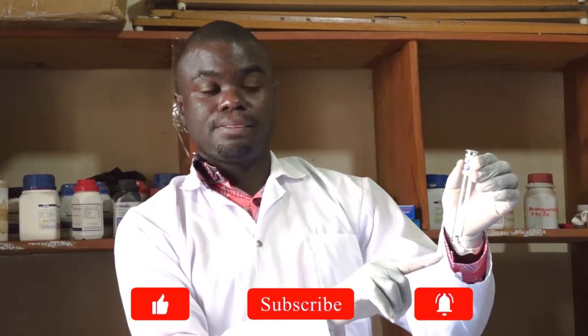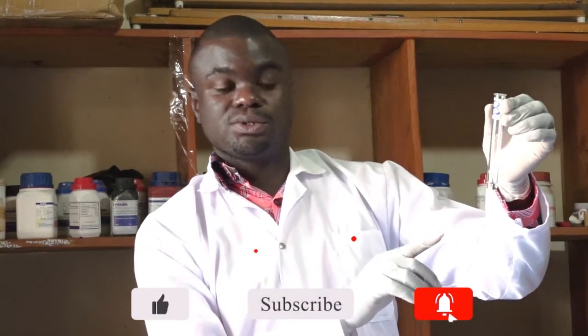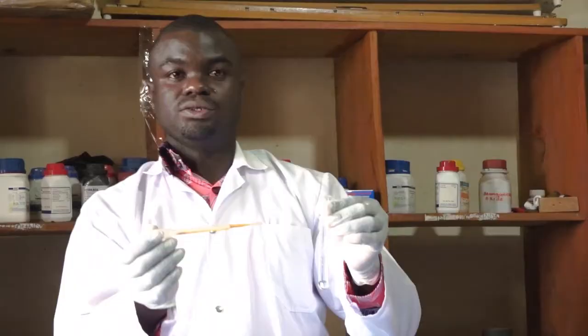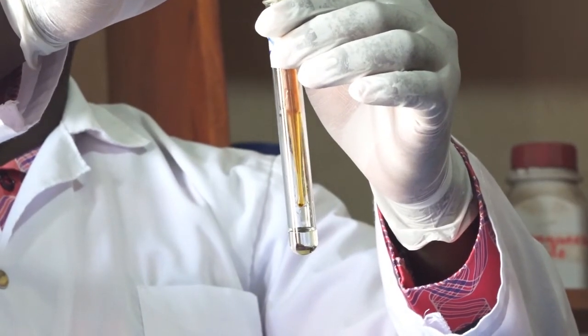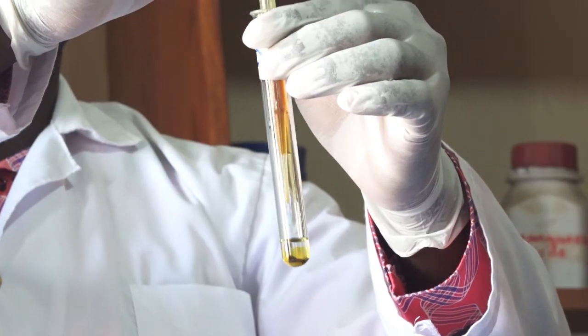Take note of the color of the original solution. And therefore I add the three drops. Remember to direct my dropper into the test tube and I release my drops. This is one, two, and three.